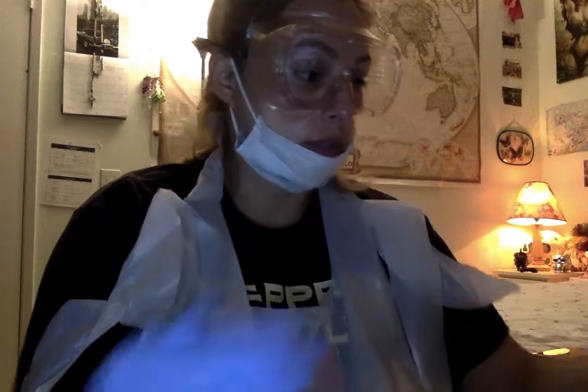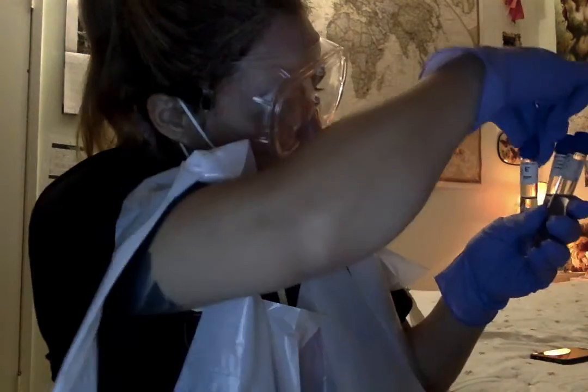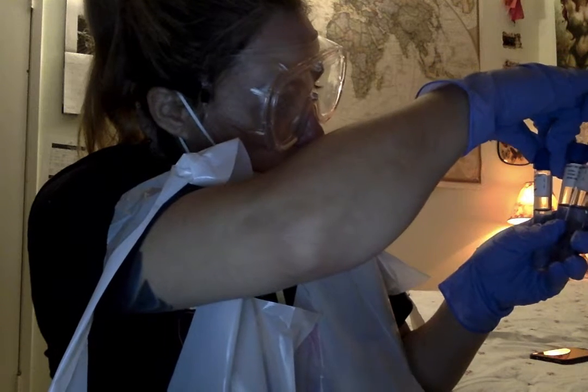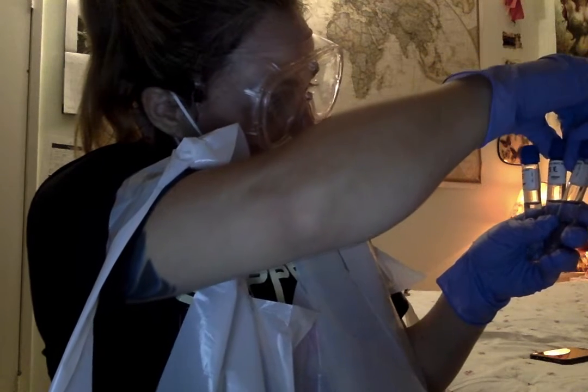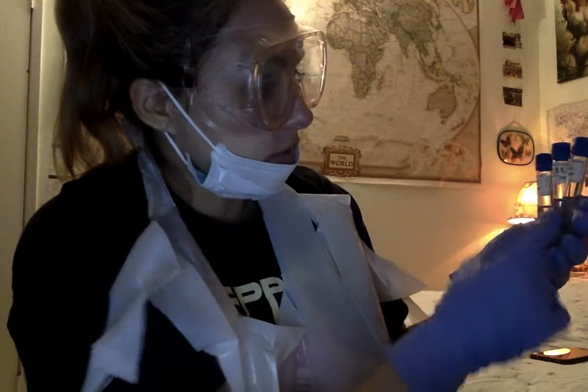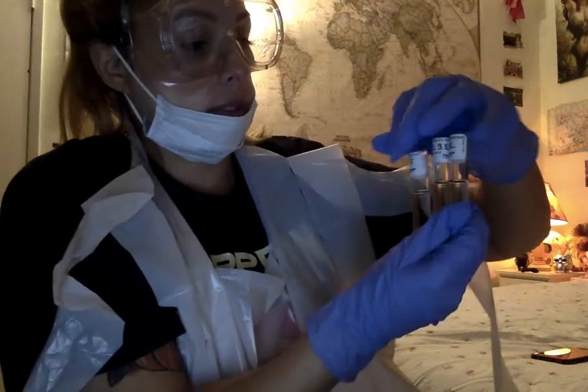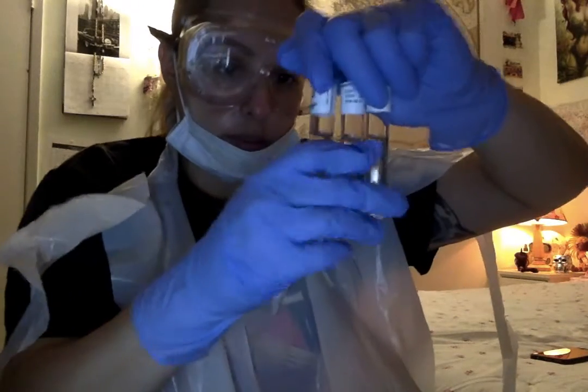They had different percentages of salt, and so I'll start with that, actually. I'm going to start with the S. epidermidis, and I want to show them all together because it's a little easier to see the turbidity in each of them. So these are my S. epidermidis broths. This first one here is the NaCl 1%. This one in the middle is the NaCl 7%, and this one on the end is the 15%.